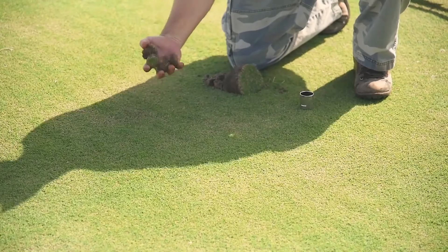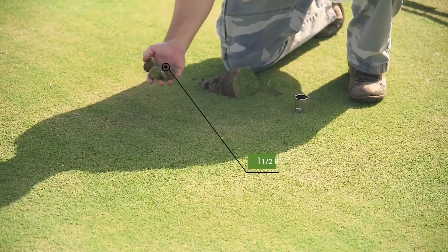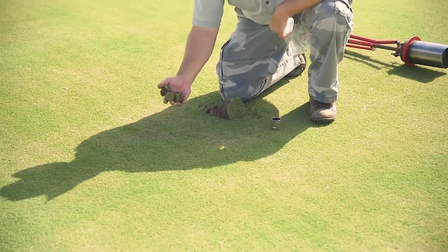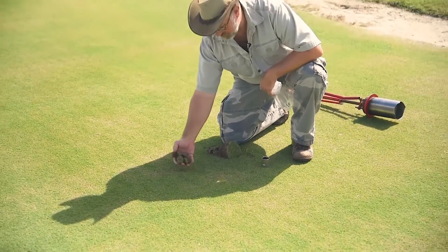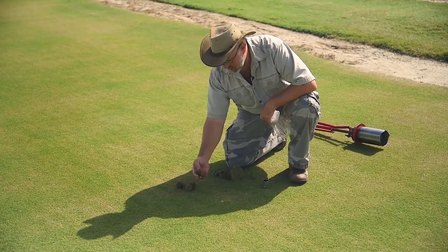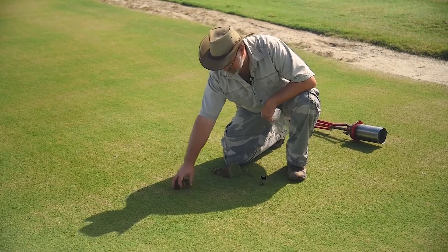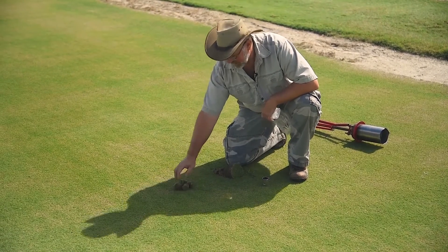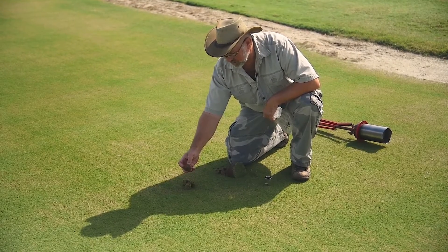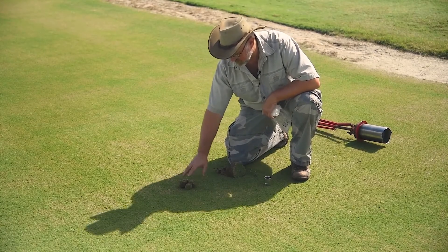Here are four plugs that we took with our ball mark plugger. In the lab, we're going to wash the soil off of these samples because, again, we're not extracting nematodes from soil — we're extracting them from roots. We'll wash the soil off, leaving the turf plug with the bearing roots and some of the thatch. We're going to put these four samples in a funnel in this mist chamber, and nematode eggs hatch from these roots. The little nematodes crawl out, crawl through a filter, and drop into a flask where we catch them.